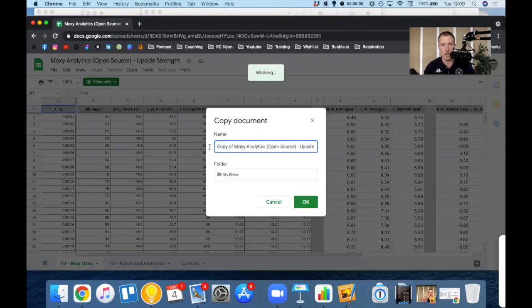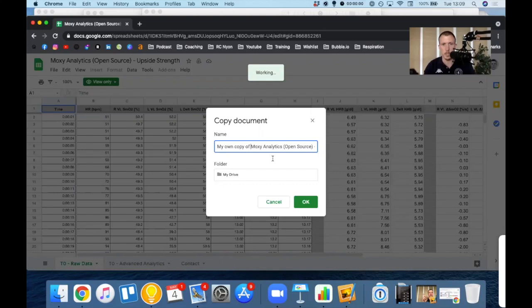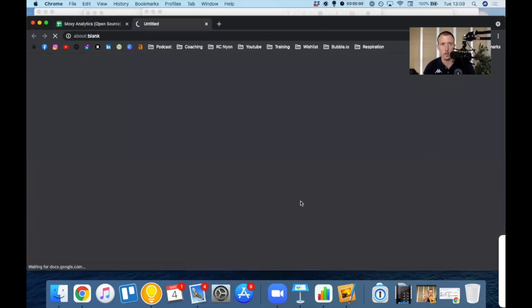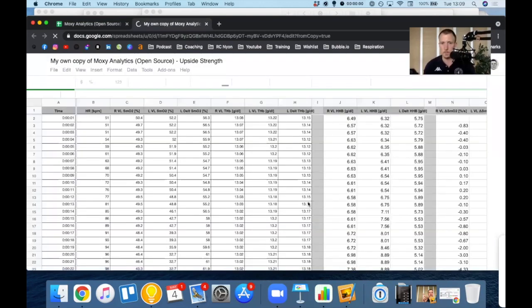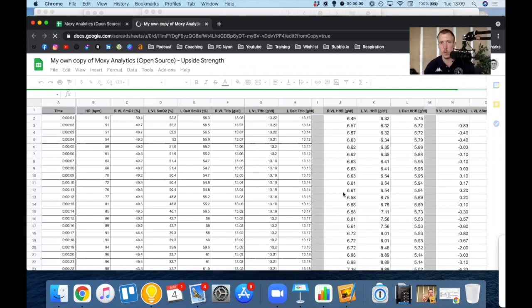Let's call it my own copy of Moxie Analytics. It's an open source file. You can do whatever you want with it. The goal is really to provide this platform for everybody who wants to be able to analyze their data a little bit quicker than what is currently available.